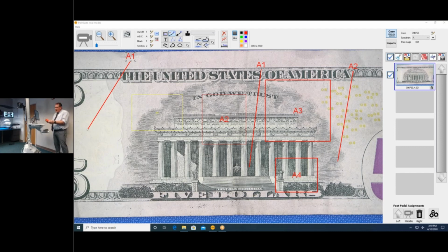And the really neat thing about the hand switch is that you can put it right next to where you're working, and it has the grab image and then toggle back to the live mode. It's got the zoom in and zoom out. And shortly, when we have the video capture, you'll have the start capture video and stop capture video.